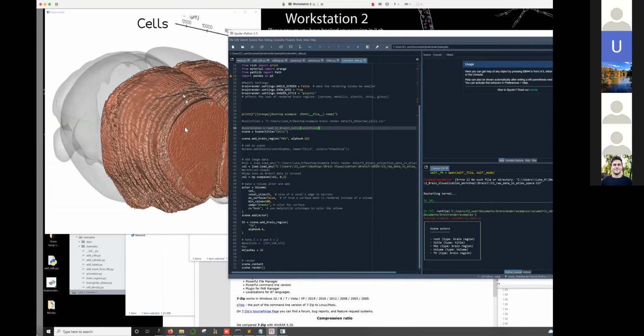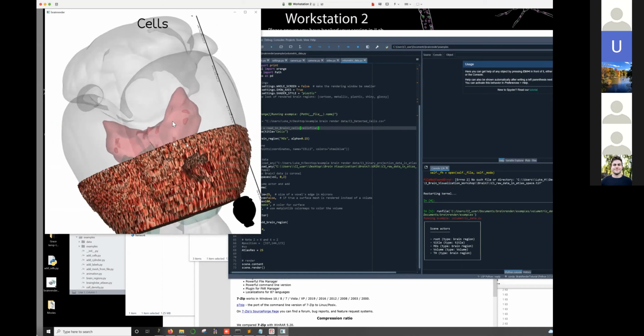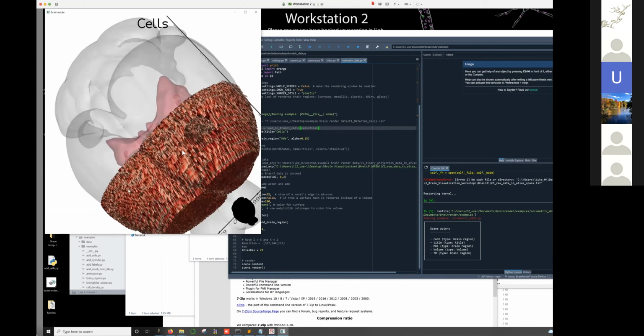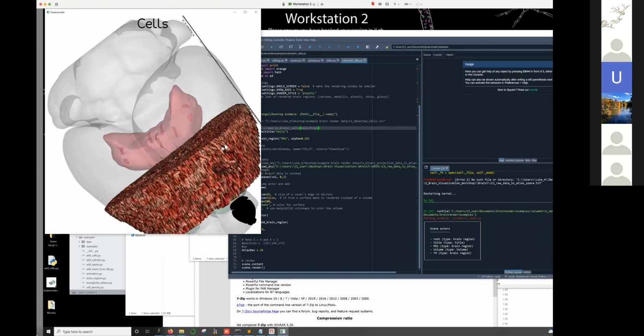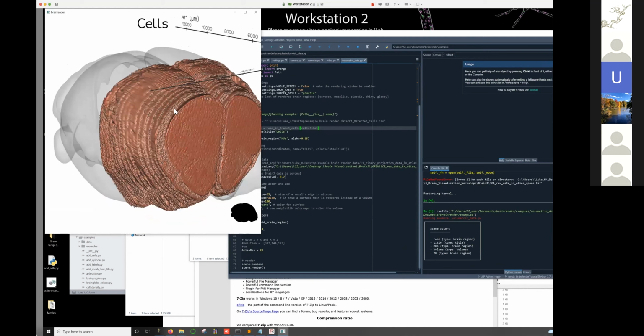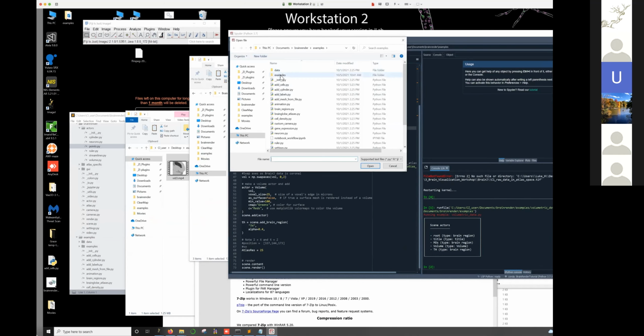Okay, so this is now that raw data. We don't really have much of a look at it in terms of transparency, but we can at least see that DAPI data, and we can see kind of where this GRIN lens is. And maybe you actually want to plot this in a better way. If you want to plot something, they give an example in here about plotting a cylinder. So if I just open this and show you very quickly in the examples, there should be a cylinder.